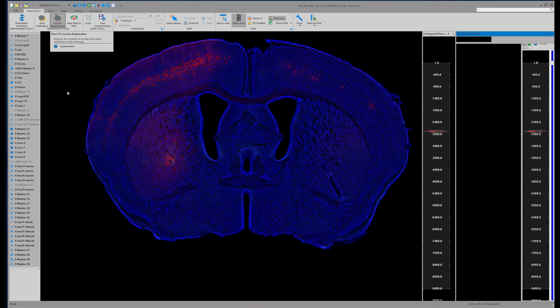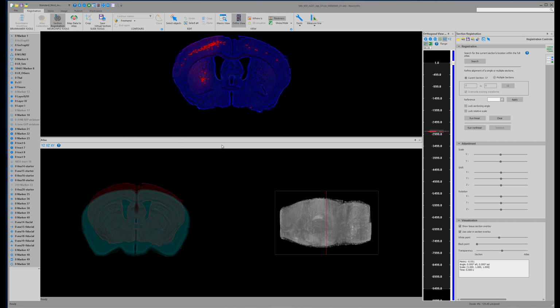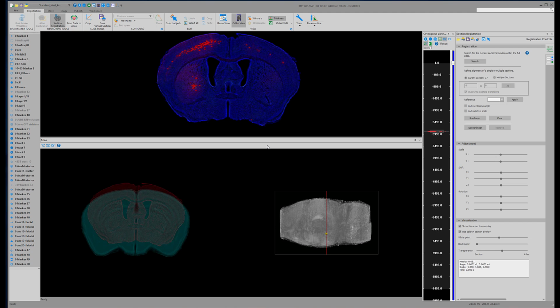And that calibration usually occurs what, like once per protocol, once per brain? Actually, we use the same atlas calibration all the time. We've done it for 1,000 brains. So you really only have to do it once. Yeah. And the other thing it does is to establish what channel is being registered. In this case, we always stain sections with a fluorescent Nissl stain, and that's the channel that's going to be registered.